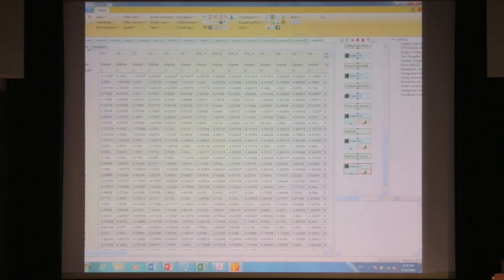If the MS1 feature is not found, we can reasonably assume that it was low abundance, or for some reason missing in the sample. So it makes sense that if we impute that point, we should choose a downshifted value. We can't give any guidelines for what you should do with your data, but you should filter stringently first.